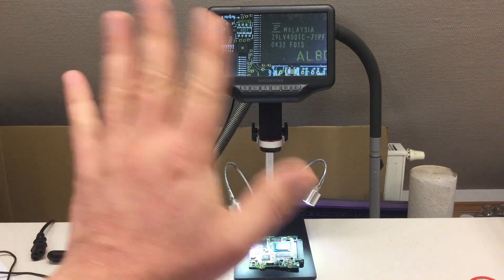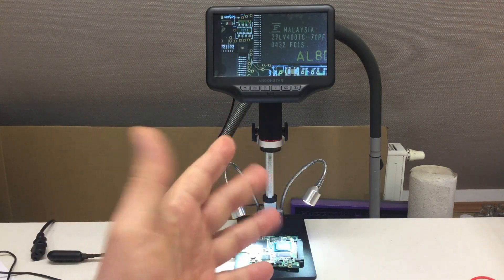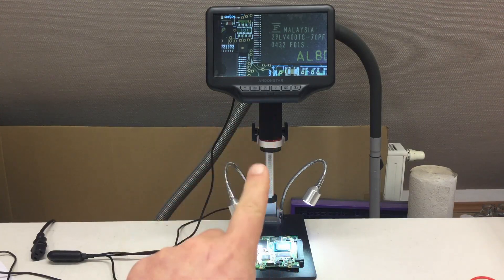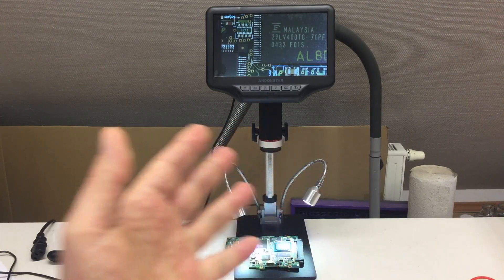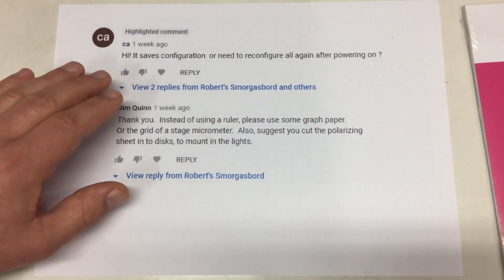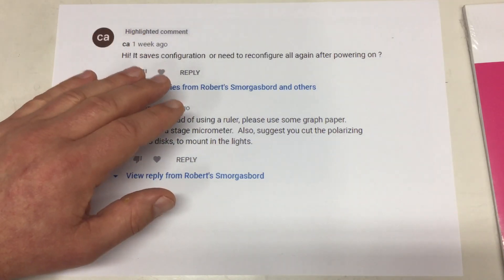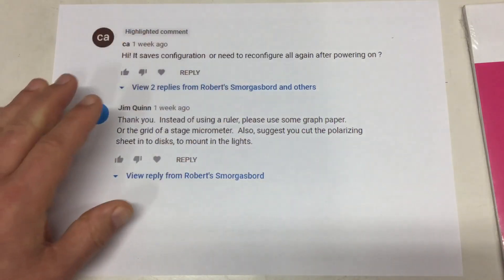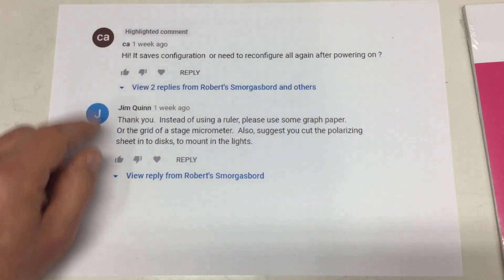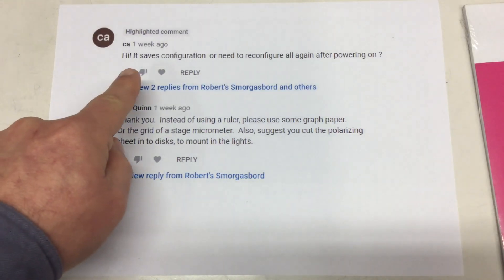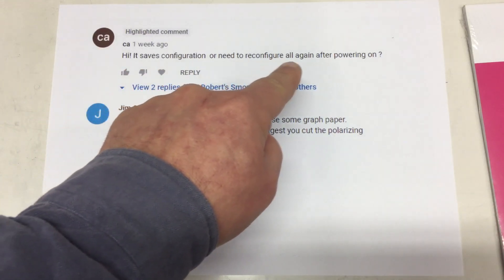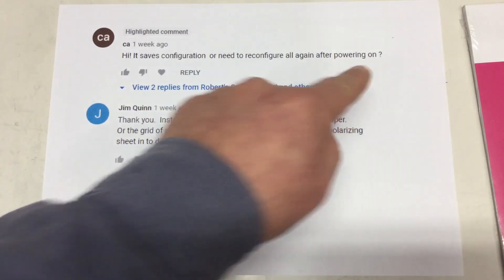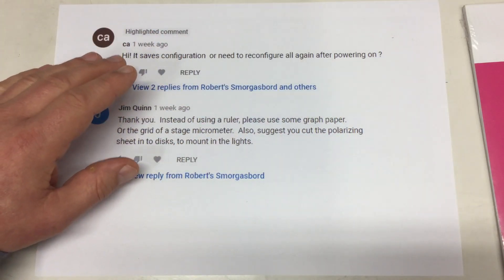Just a short, well, maybe not so short addendum to the Andonstar AD407 digital microscope. I received some comments on the review of that thing with questions. CA asked, does it save configuration or need to reconfigure all again after powering on? Easy enough to test, we will do that.